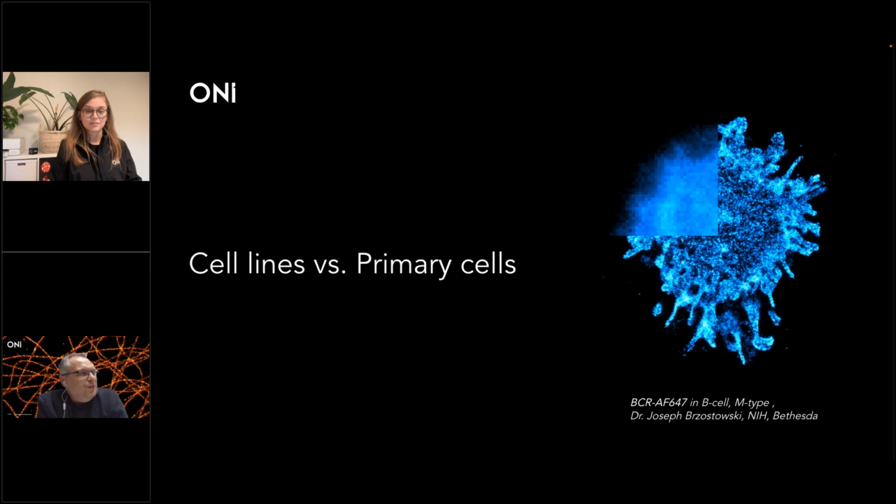This is actually a very good question. There are some publications since 2006 when the technology was discovered that are using live cell imaging. As this technology needs a lot of localizations to resolve the image, which can lead to approximately 1,000 frames you need to record. Each of them, at the fastest speed, will take around 20 milliseconds. So 20 times 1,000 is 20,000, you immediately see that you need a lot of time to record it. A lot of objects are moving very fast.